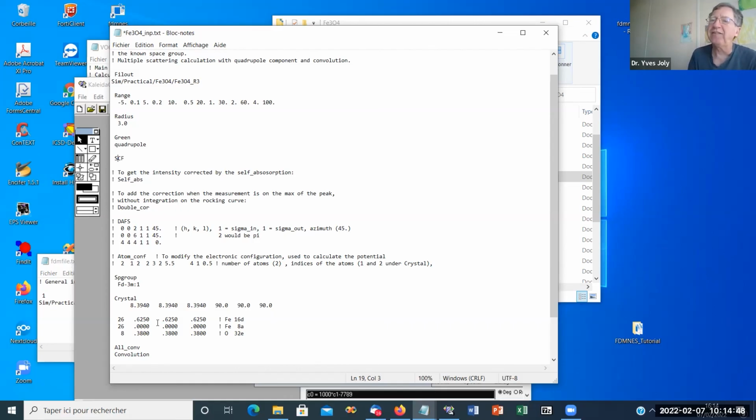For example, in a CIF file, because the hydrogen atoms are difficult to see with X-ray diffraction, sometimes they are simply not in the structure. So if you make a self-consistent calculation without all the atoms, it will be worse than without the self-consistent calculation. But anyway, if you are confident with your structure, you have to perform a self-consistent calculation. For a metallic system it's not so important, but if it's oxidized or things like that, it's more important. Indeed, you have to do that.